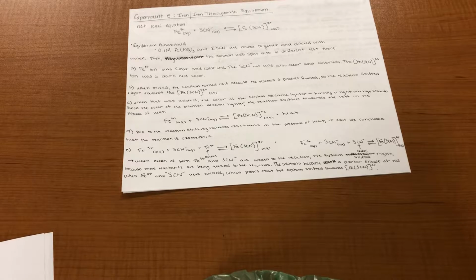Iron 3 ions were clear and colorless. Also, the thiocyanate ions were clear and colorless. The iron thiocyanate ions were the dark red color. When both the iron ions and the thiocyanate ions were mixed, the solution turned red because the reaction is product favored. So, the reaction shifted to the right towards the iron thiocyanate ions.